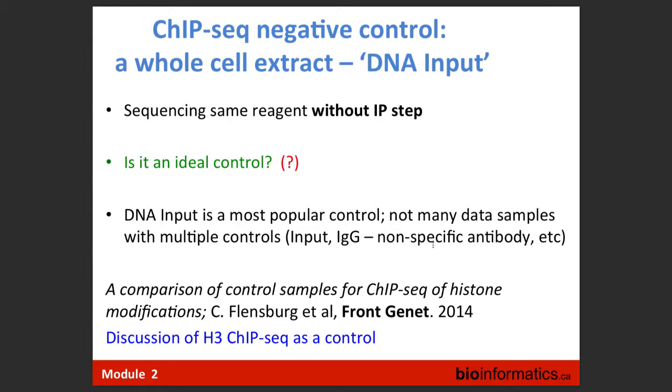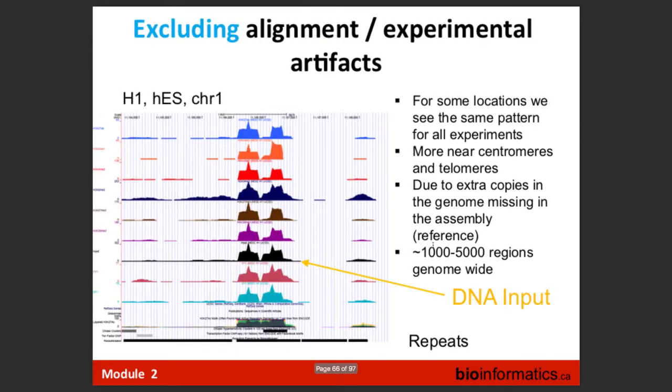DNA input as a control seems to be good enough. It's an easy assay, it's cost effective, and many people are using it. For MeDIP, yes, let's talk a little bit later. So now, why use DNA input?